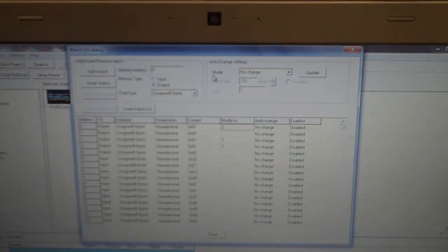This is a demonstration of the new 2000 software so that we can now control the application change through Profibus. We already have a valve box that can select different applications or different gases using a couple of other bytes in the commands on Profibus.